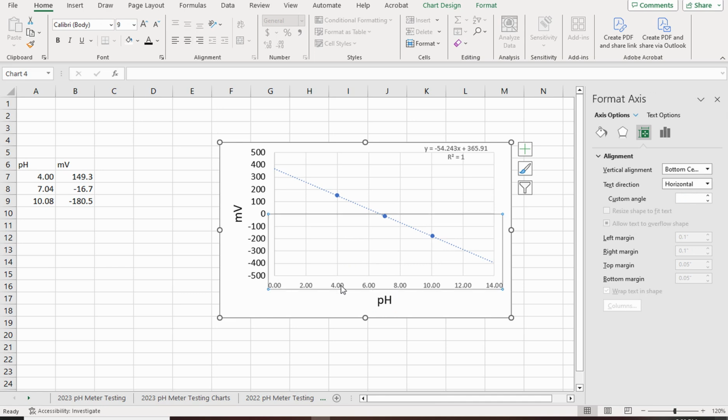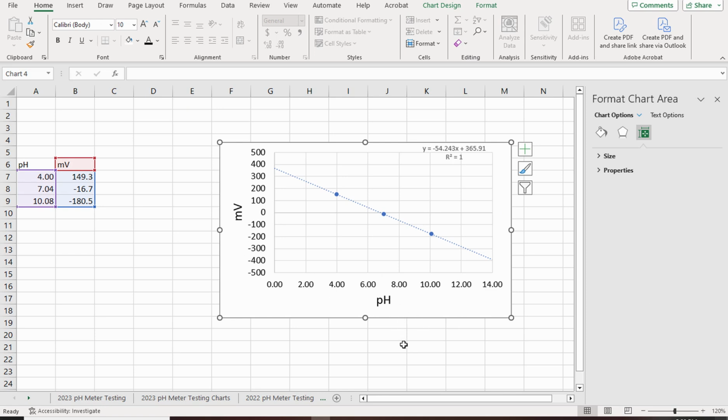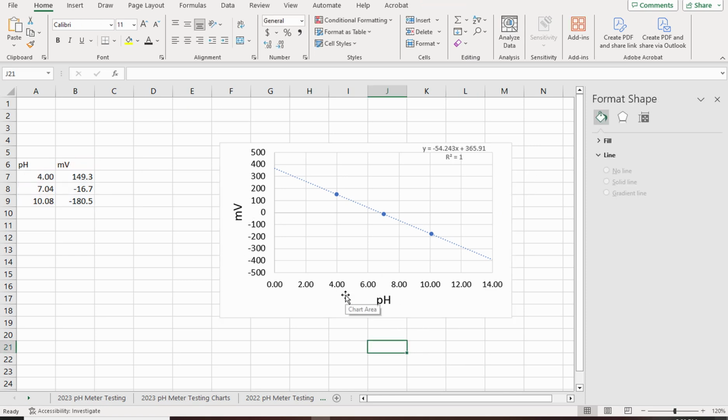And then I'm going to check on the x-axis. I'm going to increase that just so that it looks good. Turn it black so that it's nice and tight. So there we go. What we have then is our axes labeled. We have very clear numbers here. The lines that it gave us by default are fine because we can take anywhere on this and kind of see approximately where it is. So I think that the grid lines, both for the y-axis and the x-axis, work really well.